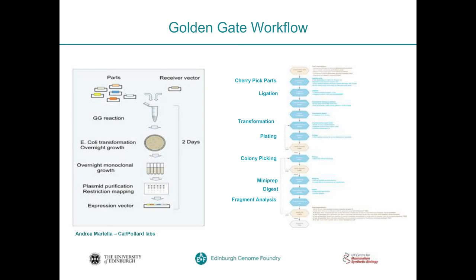Now, this DNA product is too small in quantity to be useful to anyone, including our customers. So what we have to do at this point is to introduce it into bacteria, what's called the transformation step. Now, this step is the beginning of our requirement for the QPix instrument, because it will involve plating out of liquid suspensions of bacteria onto solid agar plates. And I'll describe a little bit later how the QPix helps us do that in a high throughput and reproducible fashion.